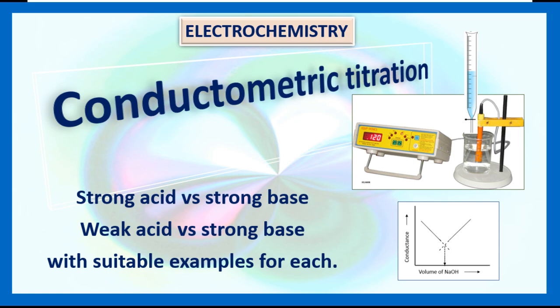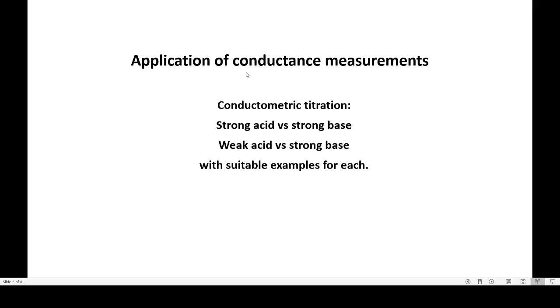Dear students, welcome. In this session, I will be discussing some of the applications of conductance measurements. Among the applications of conductance measurement, one of the important applications is conductometric titration.